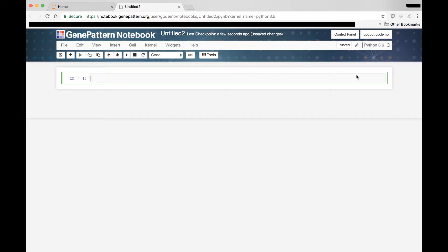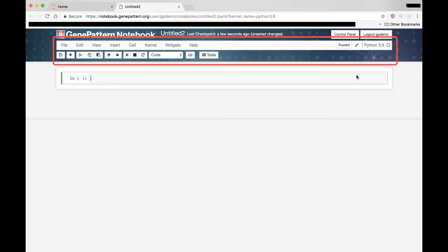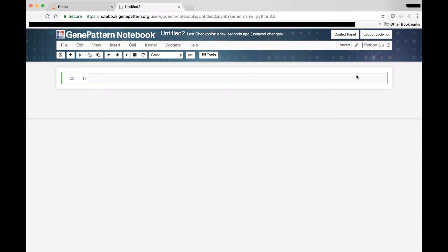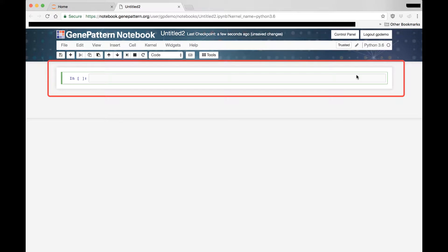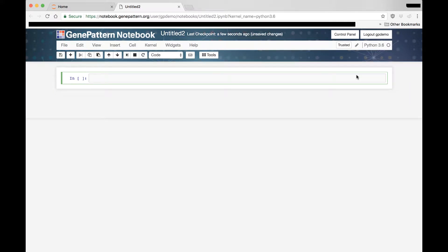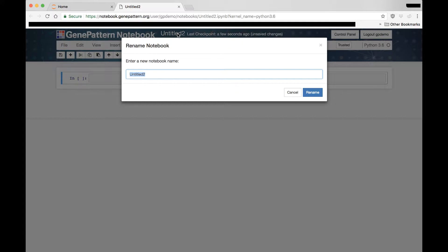Here, you see the standard Jupyter notebook interface, including the Jupyter menu, providing access to the notebook capabilities. To build a notebook, you add cells. Some cells run code, some contain information. To begin, we'll give our notebook a name.